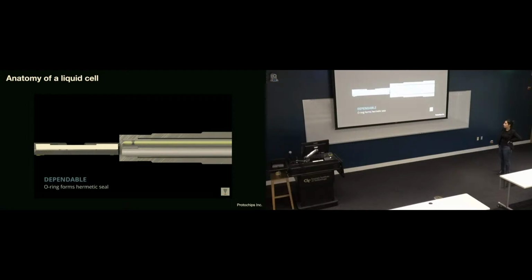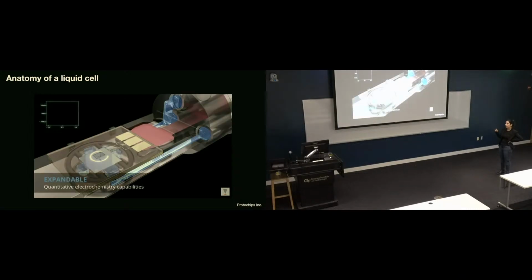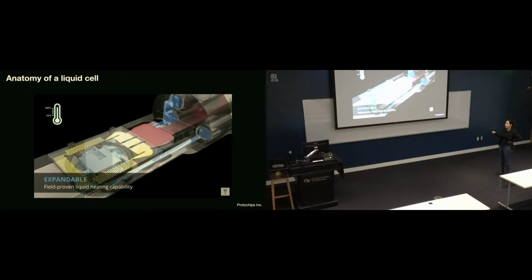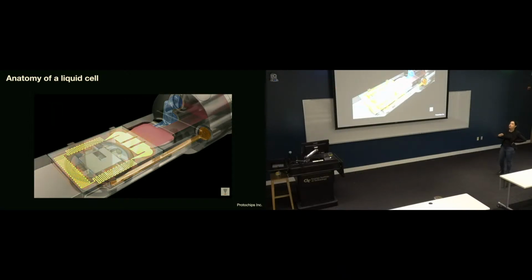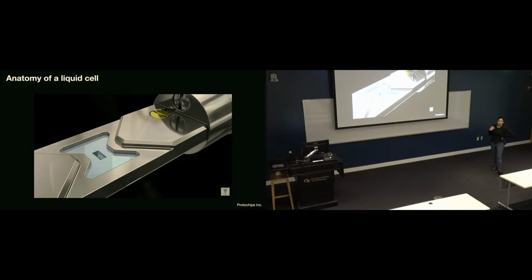And once you have that, you can also use the electrodes that are microfabricated on these e-chips to collect IV curves and do electrochemistry measurements, or also heat up your sample in situ and look at the response of your material system to the heat inside the liquid environment. So this is exactly the setup that we have here at Georgia Tech.